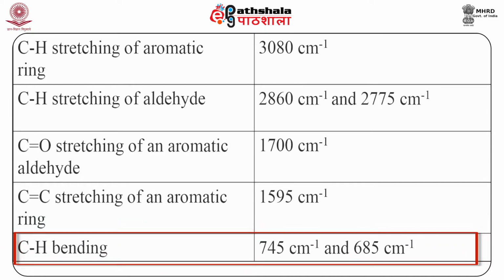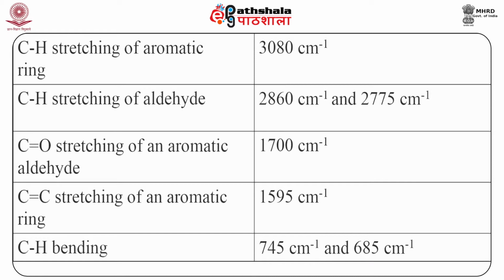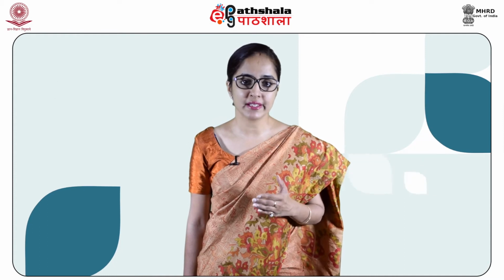No compound other than benzaldehyde can produce the same spectral details that I have mentioned above. That means if we have a reference spectrum for benzaldehyde and we take benzaldehyde and record its IR spectrum, and if the two spectra definitely match with the above data that I have stated, then that basically means that spectrum will definitely belong to benzaldehyde and no other compound.